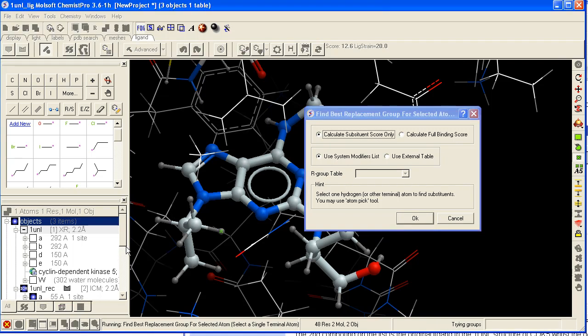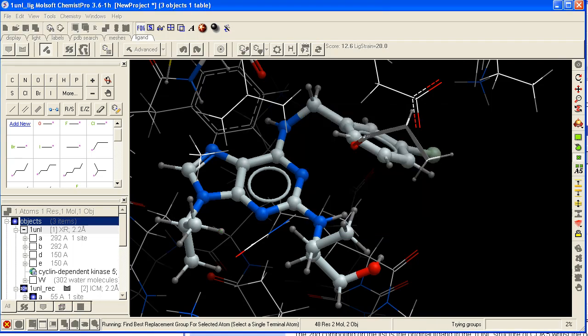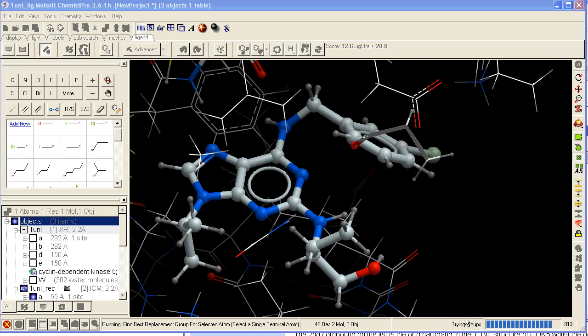Then click OK. As you can see it's trying the groups. It's virtually screening all the groups in our ICM database of substituents. And the progress bars appear here.